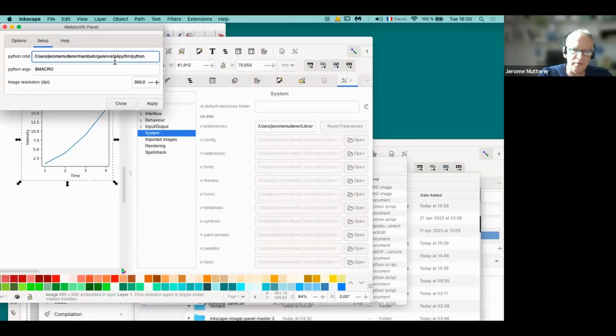And this is true for every other software, for R, for Python, for Processing, for ImageJ. But there are examples for this in the installation document that I will share with you. There are detailed instructions, but unfortunately, I'm not gonna lie, it will take you maybe one or two hours just to have it set up, and then it works, and then you will save some time. But you have to invest maybe a few hours.